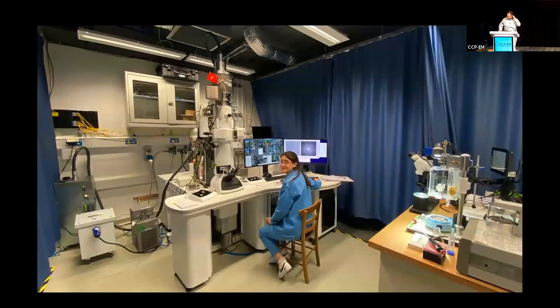So that's the cartoon, and this is what it actually looks like in the lab in Cambridge. Many of you here have come to visit, and that's great. We're happy to show everyone this. This is the new 100 keV power supply. It's a brand new design by the folks in York, and you can see the cable coming up to the new field emission gun here.